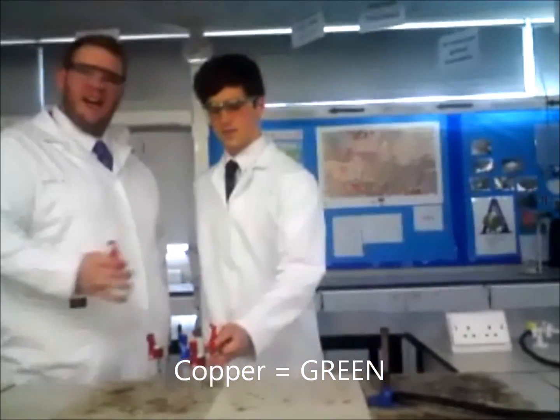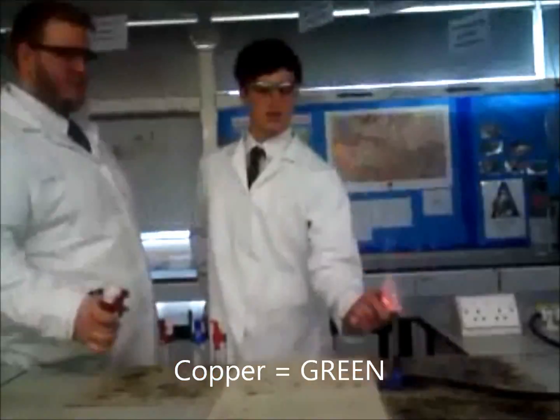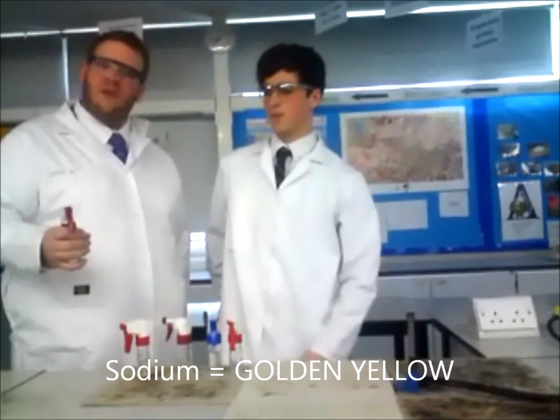That is a brilliant colour green — the green relates to copper. A lighter amber, but very golden colour, relates to sodium.